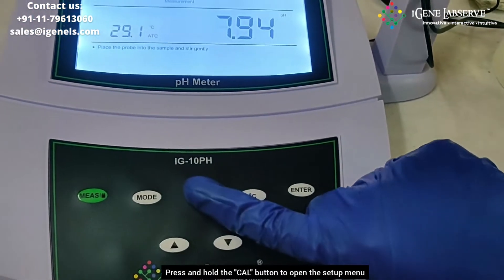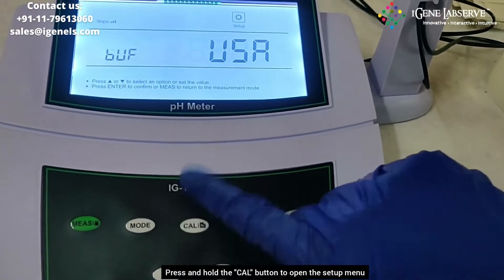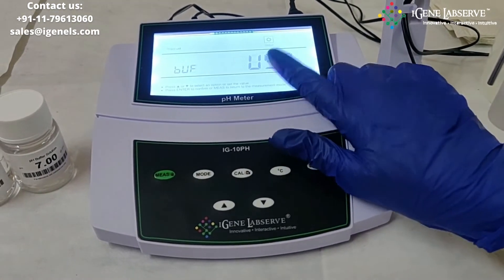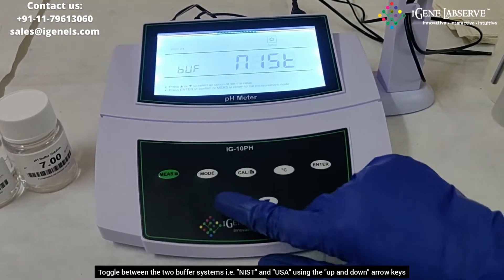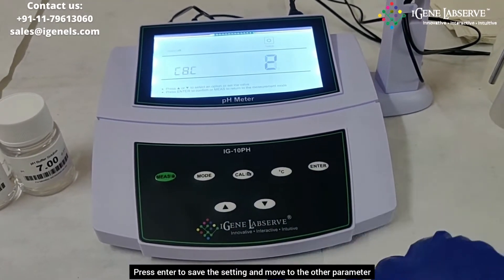You have to long press the cal button to open up the setup menu. In the setup menu, you can set up the buffer system. It has two different buffer systems, and you can set up the buffer system according to the standard buffers you are using. You can select between USA and the other option, then press enter.